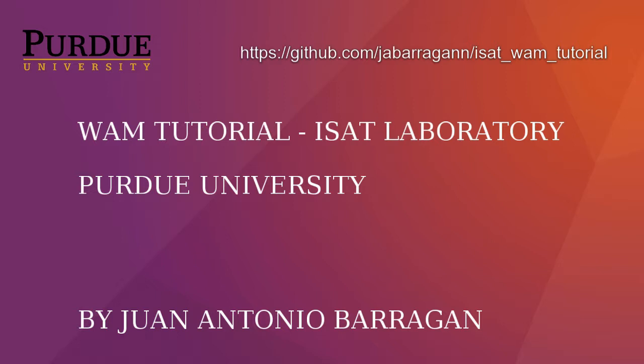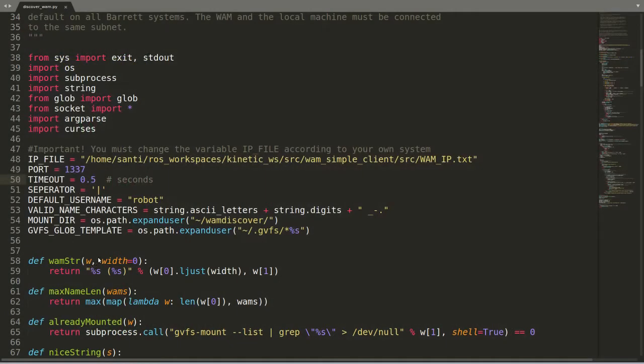So let's get started. The first file we will be working on is called discoverwam.py. So let's go to this file right now. This file is very important because you won't probably know the IP address of the WAM robot once it is connected to a router. This program was developed by Barrett Systems, and it basically will output the IP addresses of the WAM robots connected to the router where you are connected.